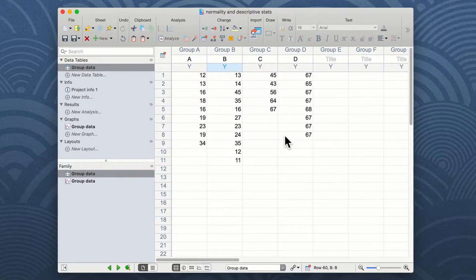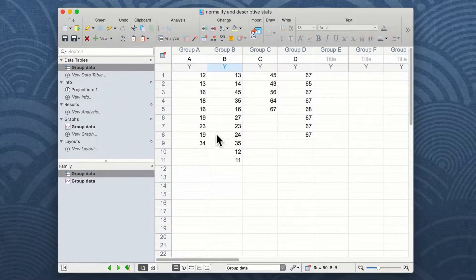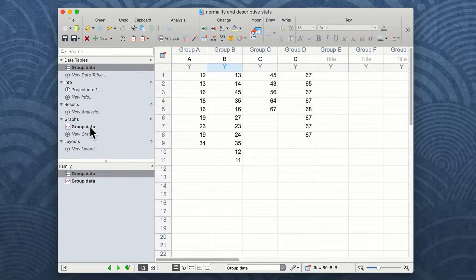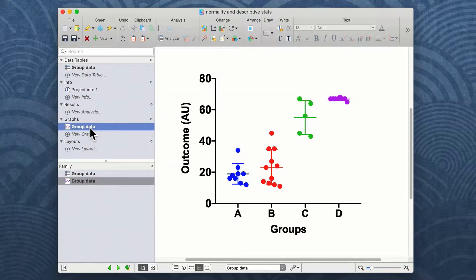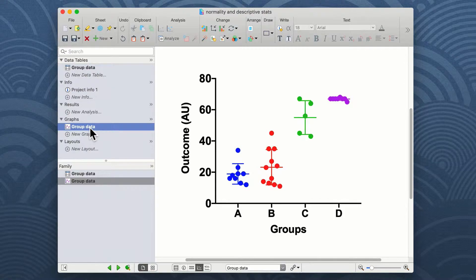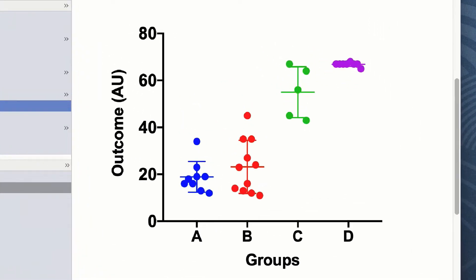We can view these data as a graph, and I've prepared the same data as a scatter graph so we can observe the distribution of our data within each group. You can clearly see that groups A, B, and C appear to have a fairly wide distribution of data and appear to represent the outcome of three different experiments.